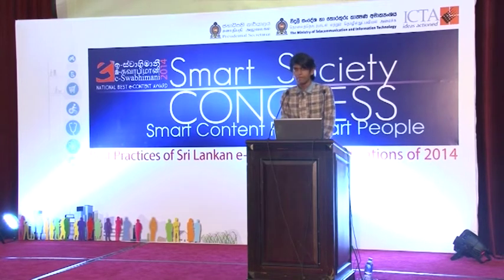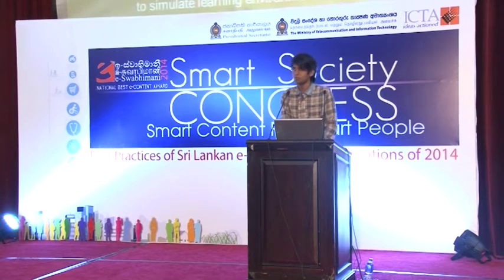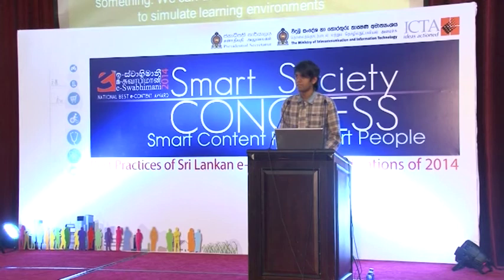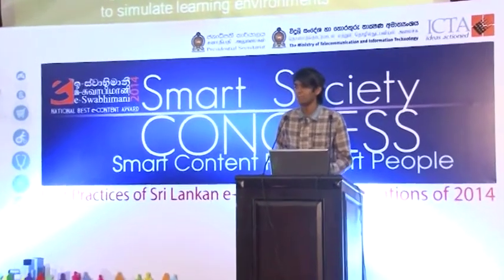And the solution for this, my idea, was to use the power of computer simulated learning environments. That is, you don't have to have the equipment to learn chemistry. You can use the power of computing to simulate this environment. And this is pretty important. The solution I came up with was the iChemist Titration Simulator.